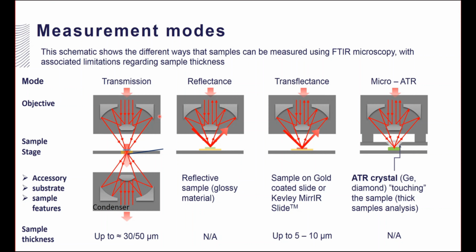So this is a parabolic mirror, and this is a hemispherical mirror that is facing the parabolic one. The infrared light bounces onto the hemispherical mirror, bounces back to the parabolic one, and is focused on the sample. If we work in transmission, then the infrared beam will pass through the sample, and in order to be collected, there will be another objective placed upside down, called a condenser, because it will recondense the infrared beam and focus it back so that it can be collected by the detector.